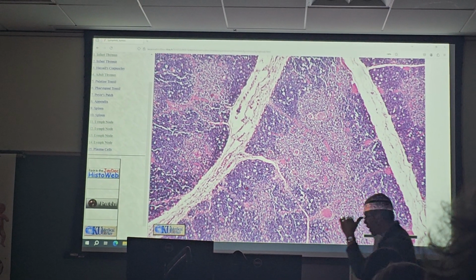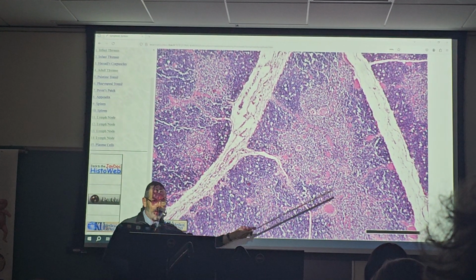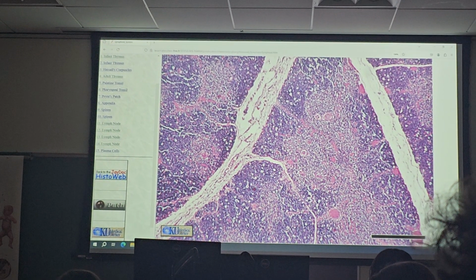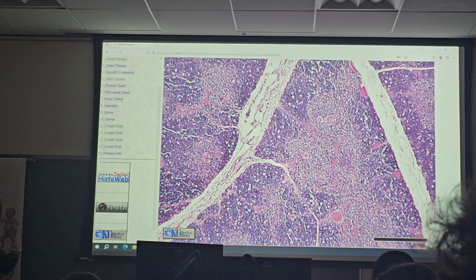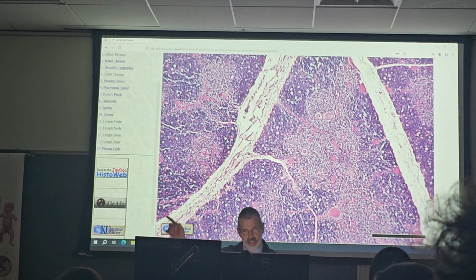Biology land, because of who we are, we view those as rooms. So you have rooms of dark and light all over the place. Not one ring to bind them, but rooms of darkness. Sounds like we're quoting some Mordor here. But these relationships are in separate areas. So this is a thymus. A thymus has rooms dividing the dark and the light. Make sense? One ring node, rooms, thymus.